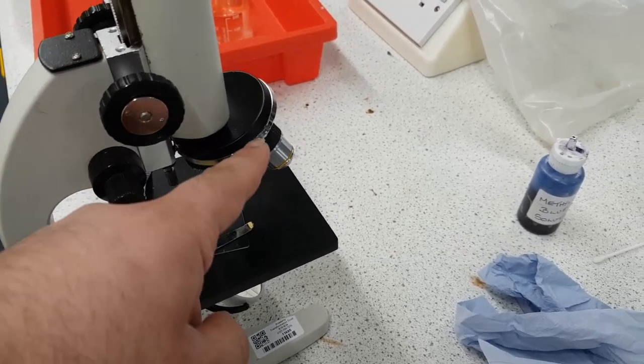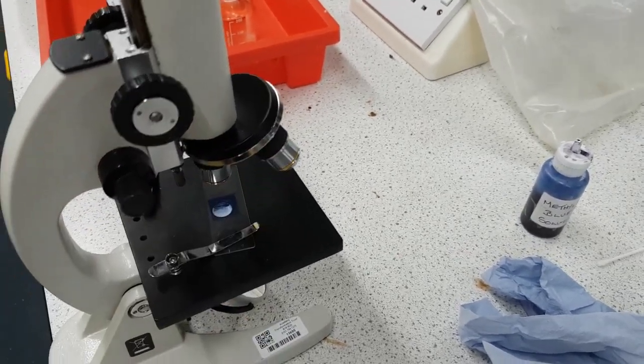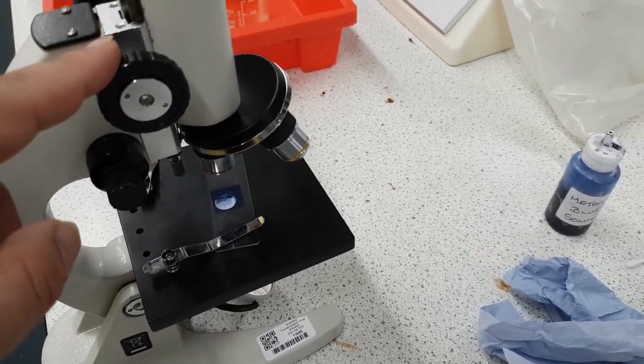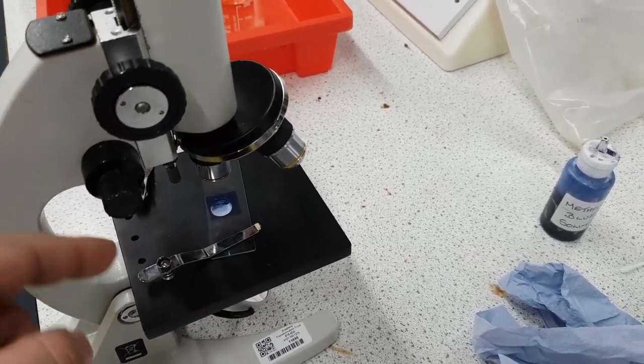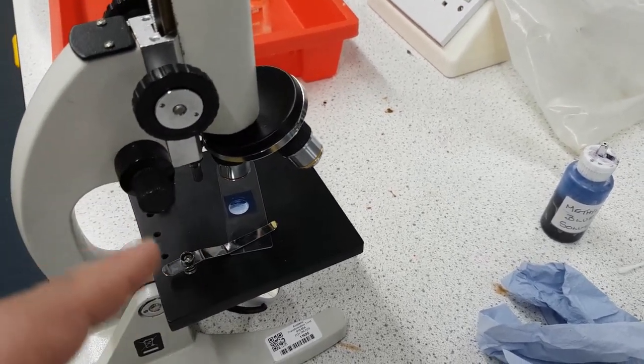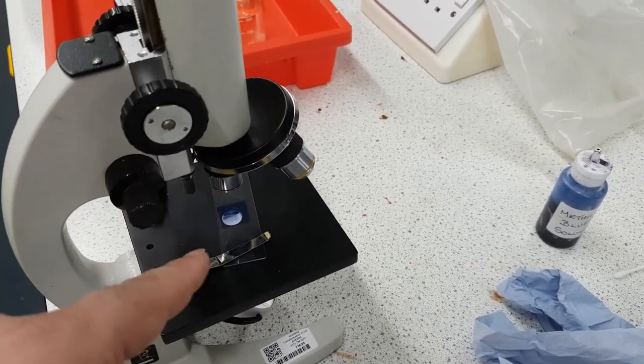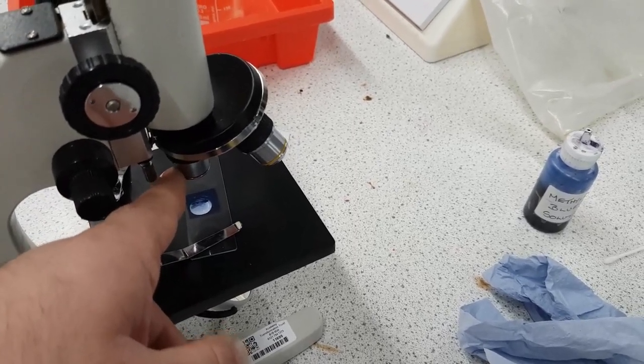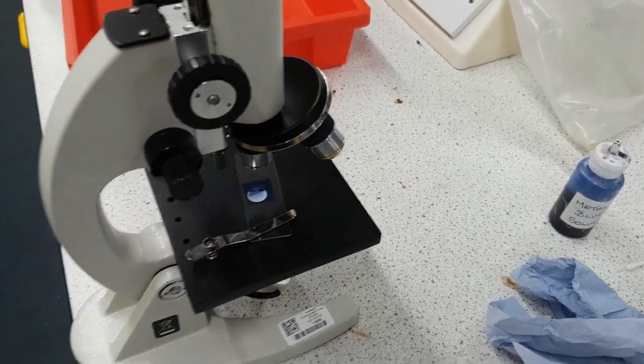And then once you're happy with that then you can move up to the next magnification which is the yellow one. But with that you're going to not use the coarse knobs because they won't work so well, you're going to use the fine knobs and you might find that you even have to reset it all the way from the beginning. But you want the large field of view first and then followed by that and that is the microscope experiment done.